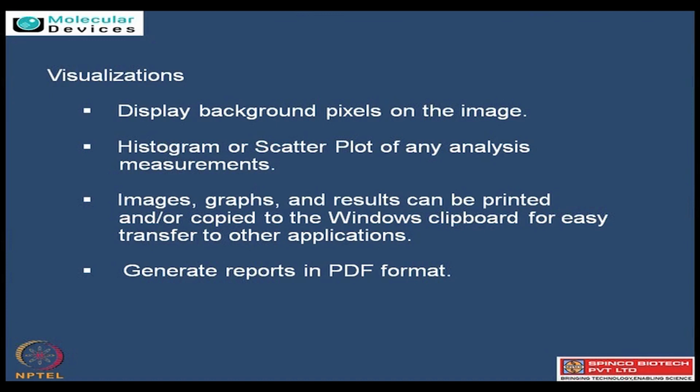These scatter plots can be plotted against the channel type, say laser 1 versus laser 2, or wavelength 1 versus wavelength 2, classically say Cy3 versus Cy5. How have these two behaved for me? Again, different kinds of graphs, and the images can also be exported to PDF as well as visualized in GenePix Pro for further screening for different QC applications.